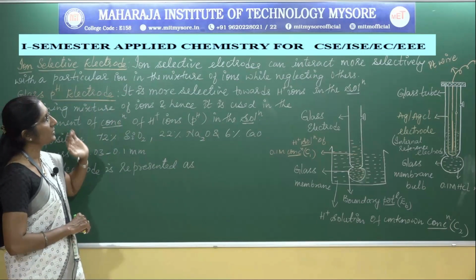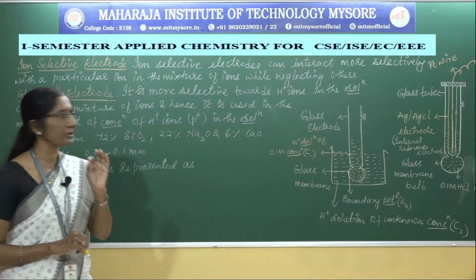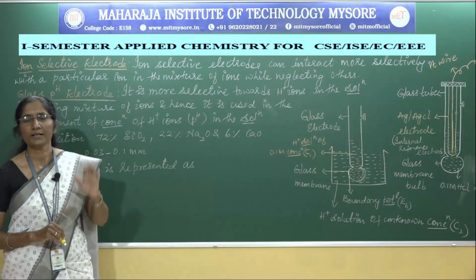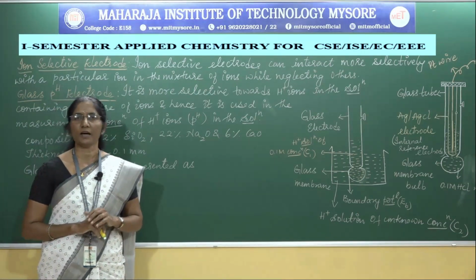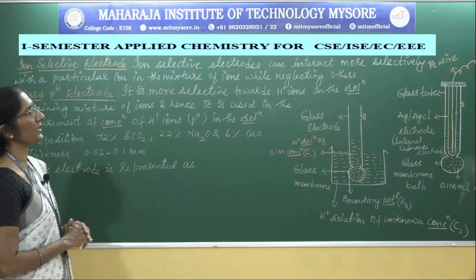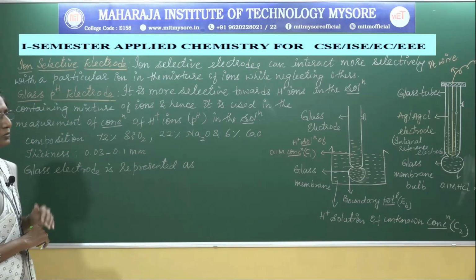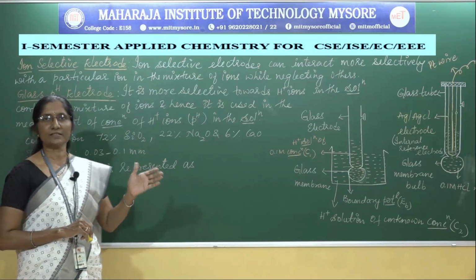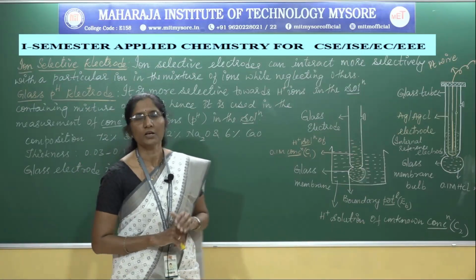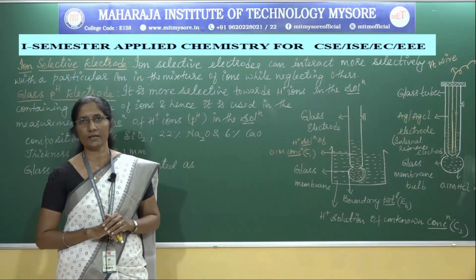Observe that the name itself represents these electrodes: they select a particular ion in a mixture of ions and develop a potential. Such electrodes are known as ion selective electrodes. That means they can interact more selectively with a particular ion in the mixture while neglecting the other ions. Therefore, these electrodes are used to measure the concentration of a particular cation or anion in the mixture.